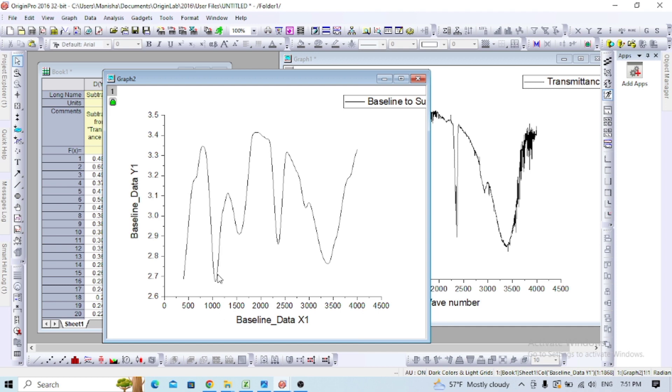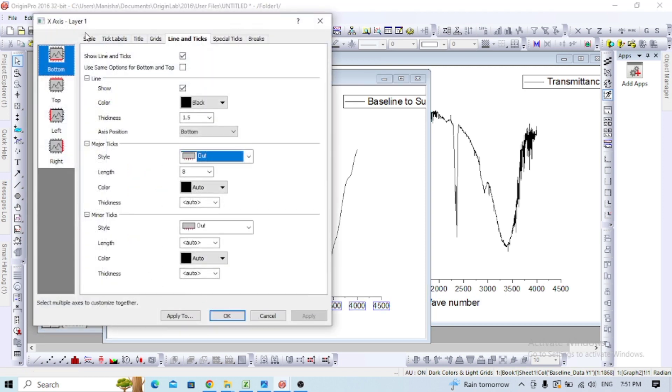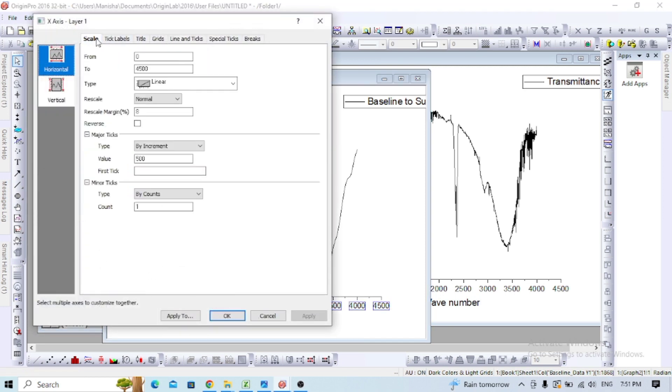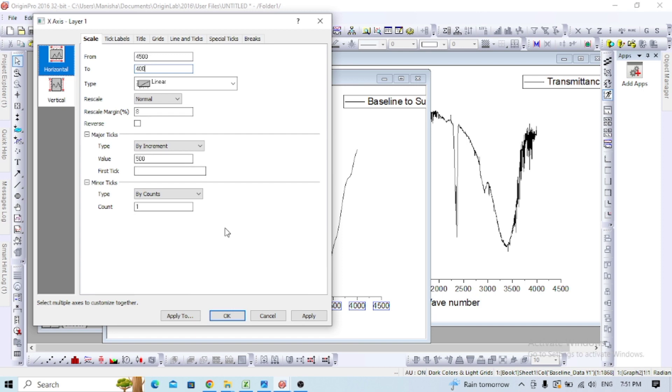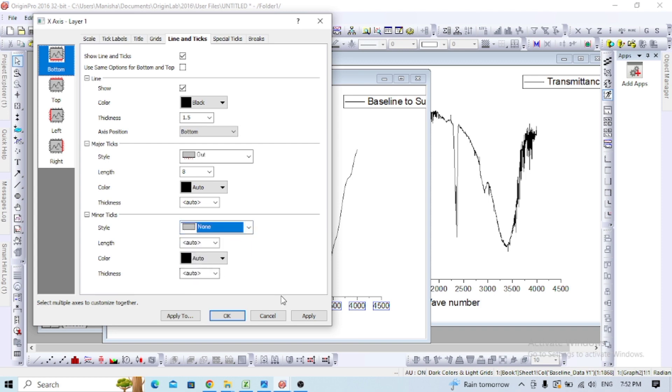For FTIR data, you need to change the scales. Go to properties and adjust the scales. For line and ticks, you can change the minor ticks to none and apply.